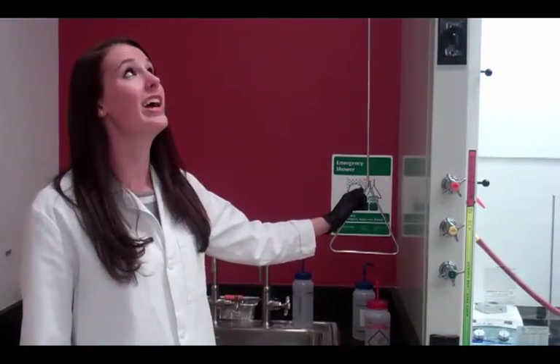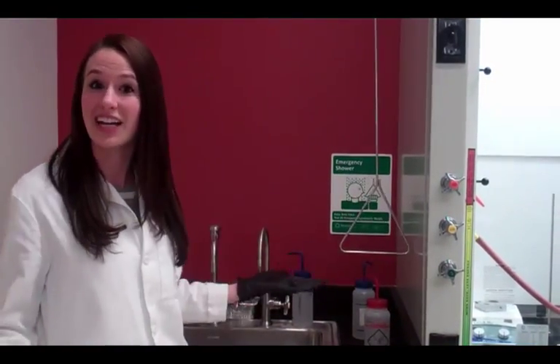Okay, so over here we just wanted to point out a couple safety things here in the room. So in the event that something does happen, you get chemicals in your eyes that's really not good. You don't want to go blind. So you're going to come over here to our eye wash station. You're going to wash your eyes out for 15 full minutes. We also have a safety shower in case you get chemicals on your body. We're not going to pull this because we don't want to flood the room, but it is there in case you need it.